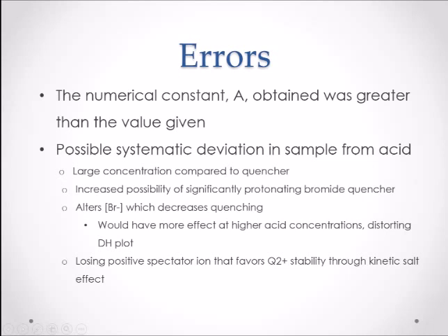We presume that the biggest error in our experiment came from the influence of nitric acid. Because the concentration of nitric acid was significantly larger than the bromide ion quencher concentration, there was an increased chance of bromide ion protonation. This would result in decreased bromide ion concentration, which would in turn decrease quenching and distort the Debye-Hückel plot. This would have also resulted in the loss of positive sodium spectator ions that favor quinine dication stability through the kinetic salt effect. We think that these errors are the reason that our numerical constant, which turned out to be 1.61, deviated from the given numerical constant of 1.16.